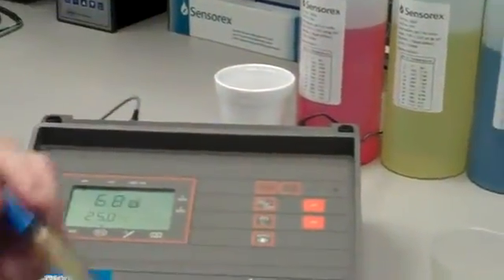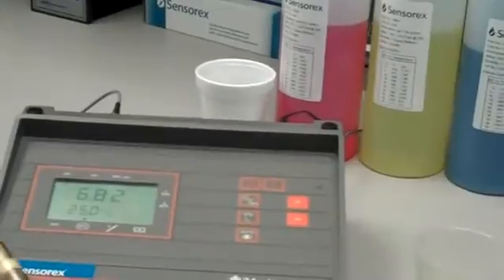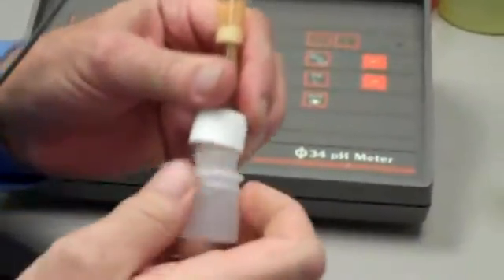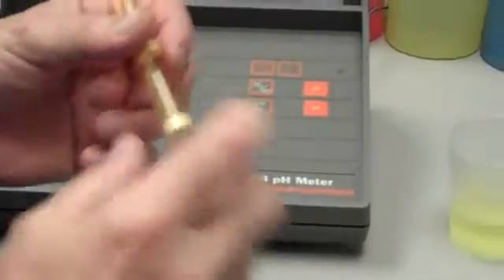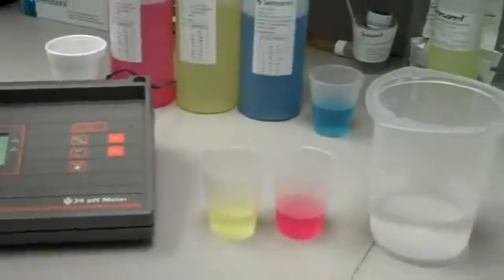I'll turn on the meter, and I'll remove the soaker bottle that's provided by the manufacturer of the electrode. The soaker bottle keeps the electrode moist and ready to go out of the box.